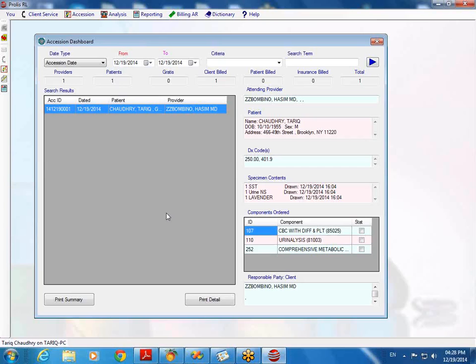Remember how I said yesterday that our lab is in San Diego, but our headquarters is in Vancouver? I guess the question we're wondering is, if the lab receives the sample and they can see this accessioning dashboard, could we in Vancouver also see that accessioning dashboard?